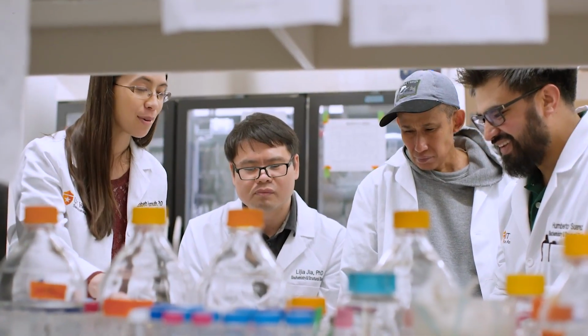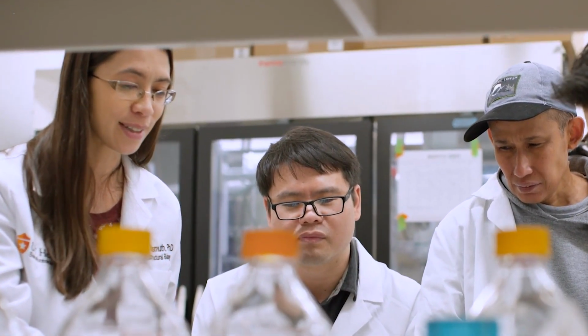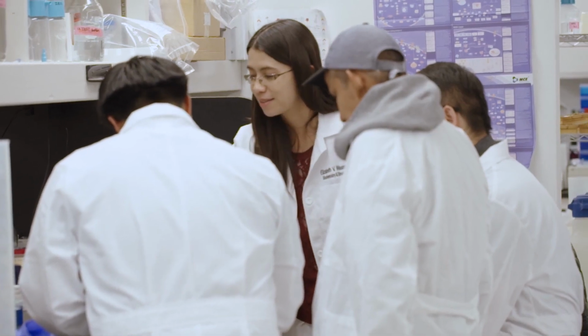What does this thing look like? What's the shape? How does that inform the function in a normal cell? How does that lead to prostate cancer? Even now, as we speak today, we're collecting on something that I never thought would form this shape, and it's nuts. And cryo-EM can give you that feedback almost instantaneously.